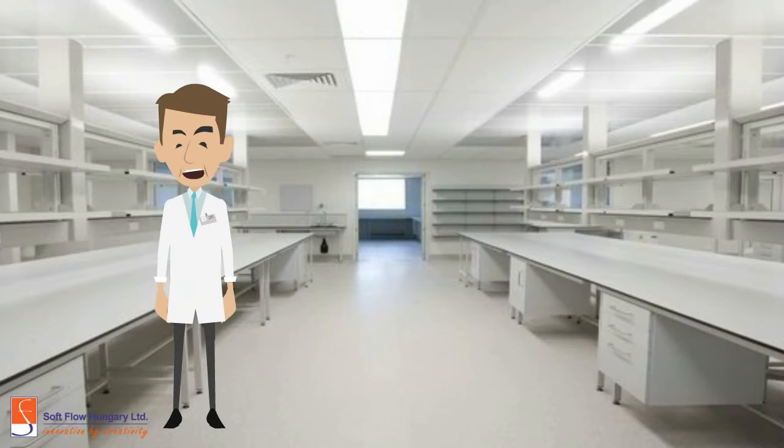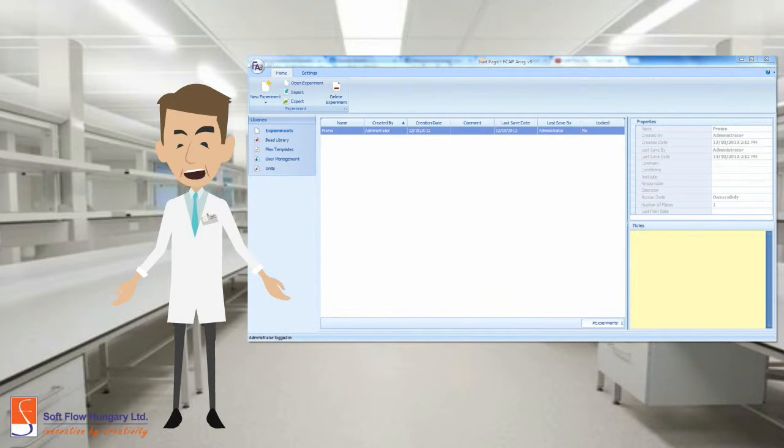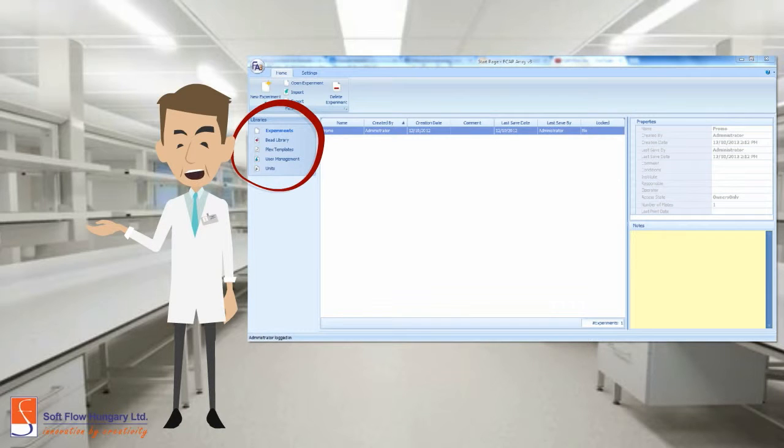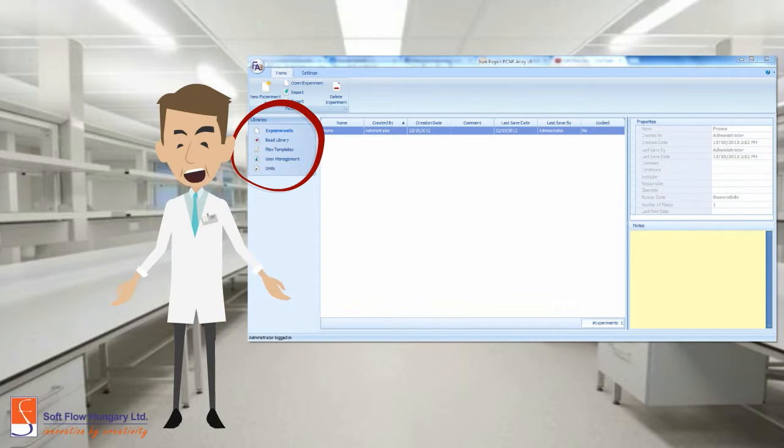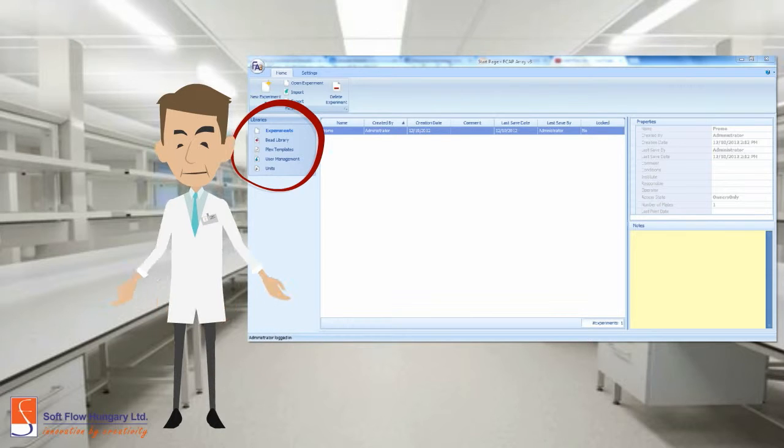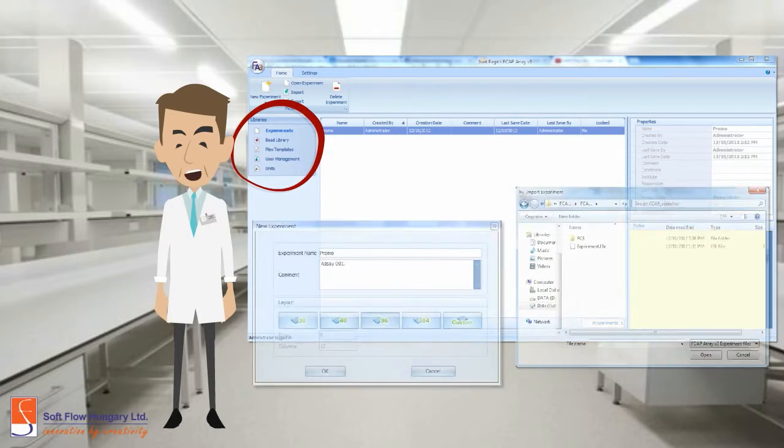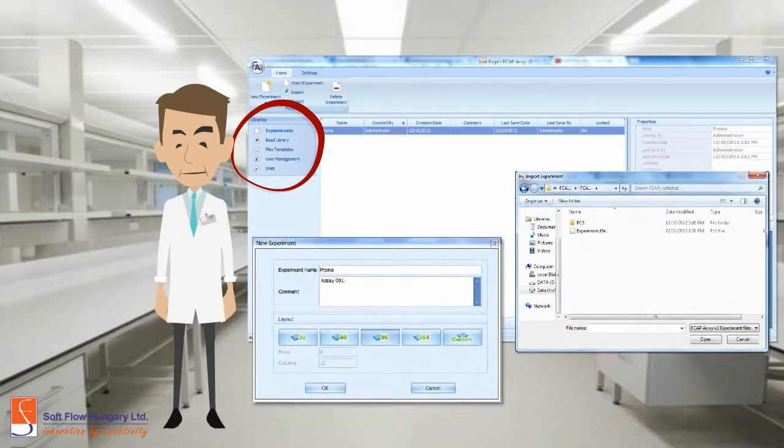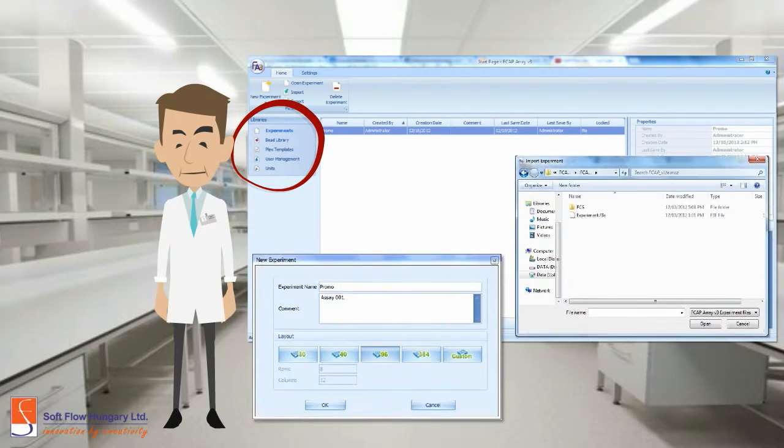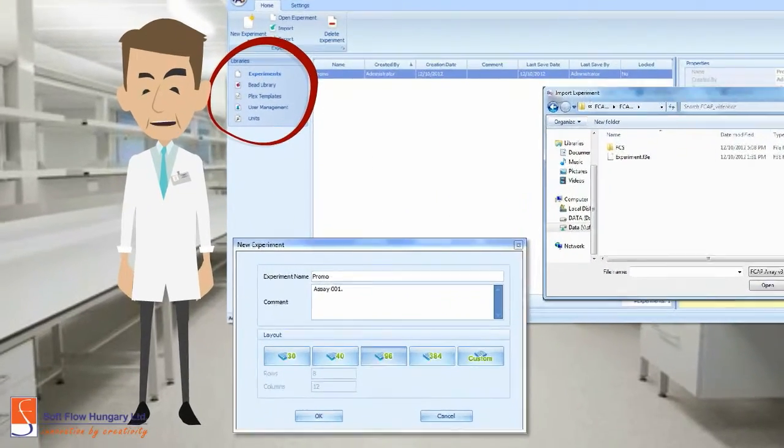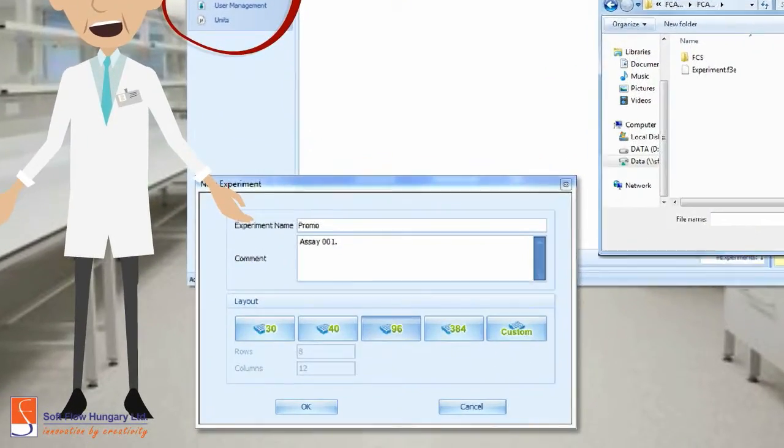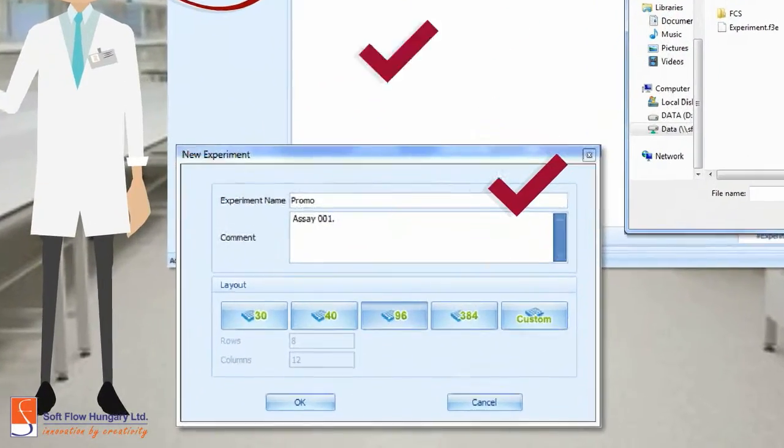This is the start page of FCAP. The library's menu is positioned in the left part of the screen. Here you can add the inputs you need. In the experiment session, you can select to create a new experiment or to import one. To create a new experiment, you have to inform the name, comments and layout.